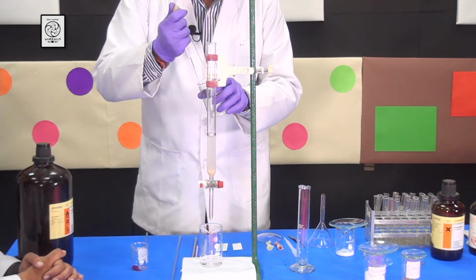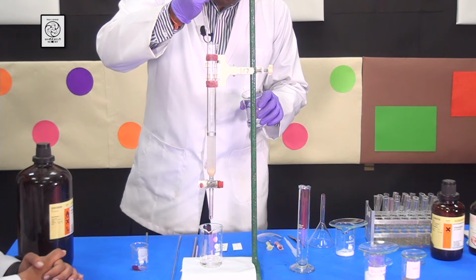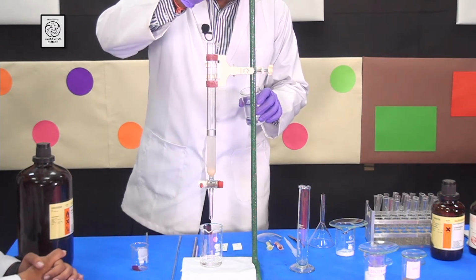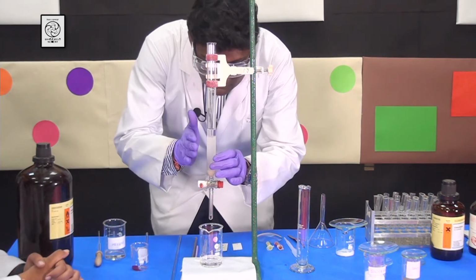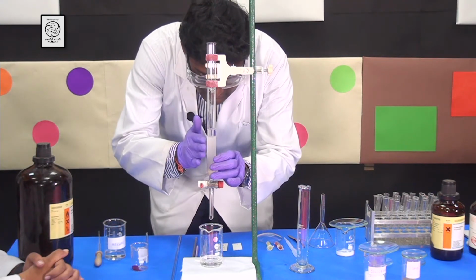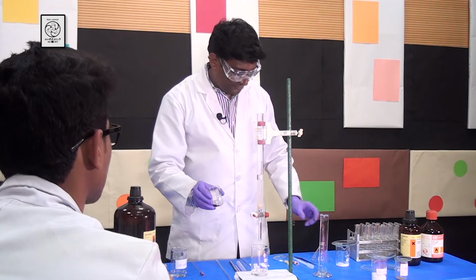I'll pour a little bit more. Now you can tap the column if you want to make it a nice layer. Now I am going to load the compound using the funnel.